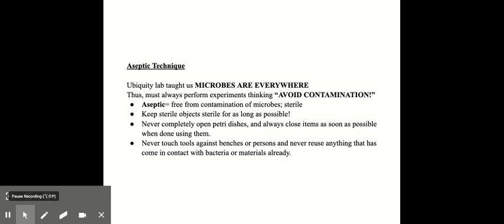So that's done by never completely opening the petri dishes. Meaning hold the lid slightly open in a clamshell technique. And also always closing items as soon as possible when you're done using them. Never touch your tools against the lab benches or against people. And never reuse anything that's come in contact with bacteria or materials already.